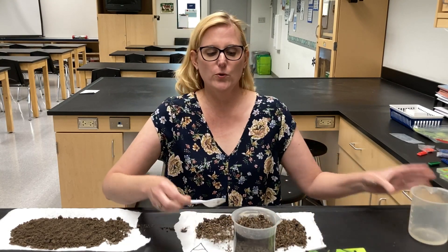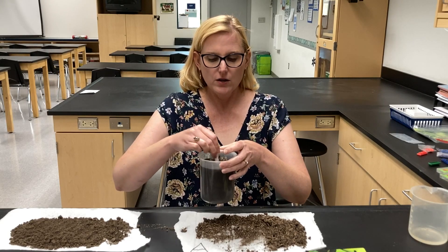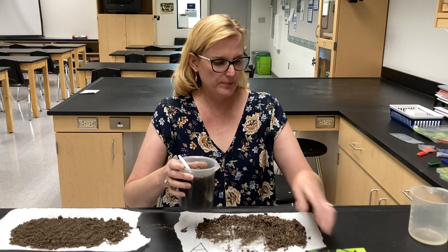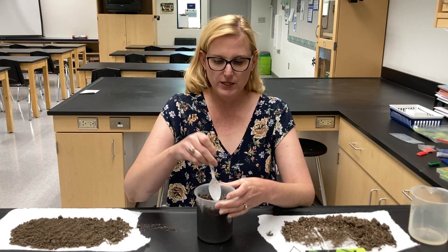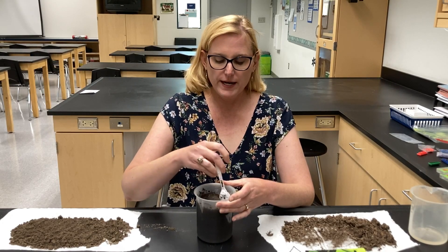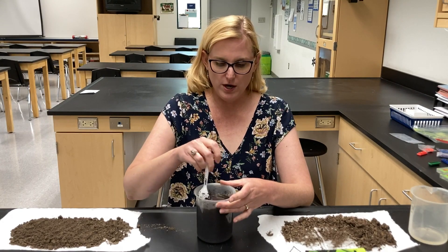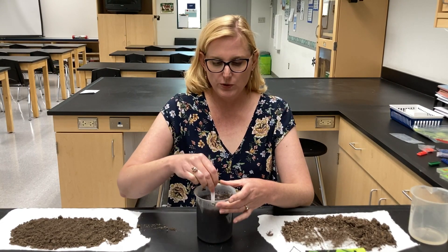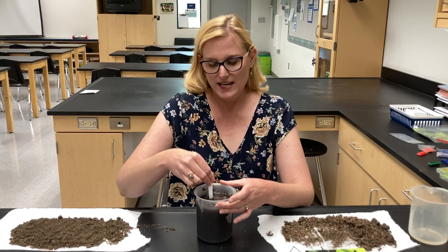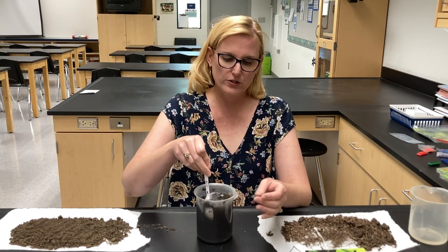For the soil samples here, we are going to mix with water — I'll use tap water for this one, and distilled water for another part to test the pH. We mix one part soil to five parts water, stir it up really well, and we're going to check the ions as they come out of the soil into the water solution.